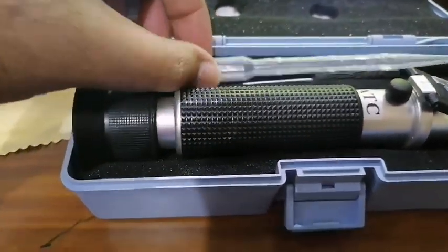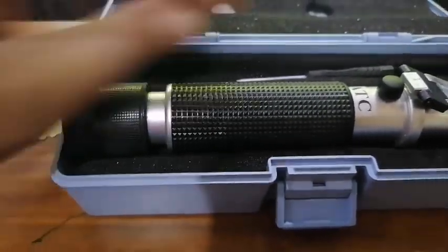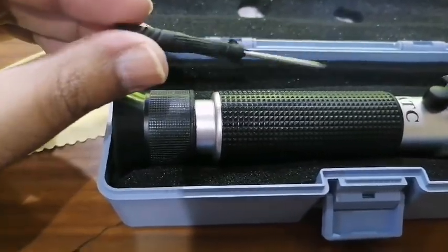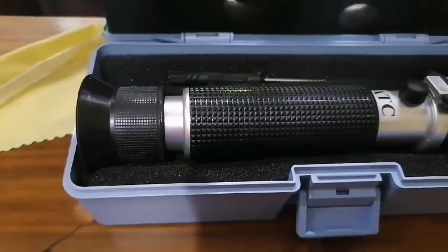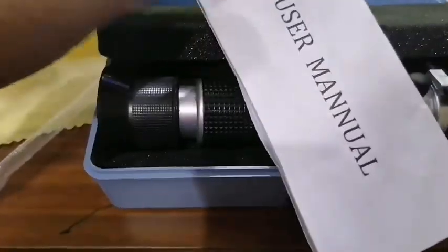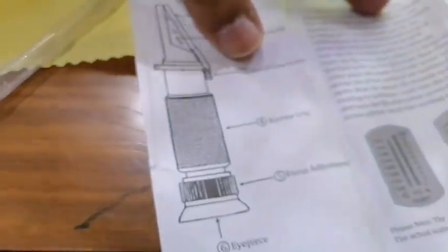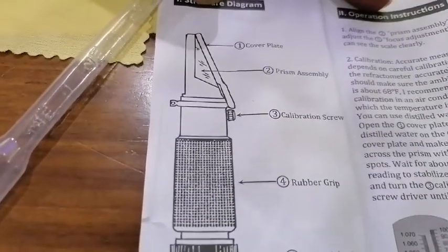Here is the refractometer, and this is the dropper for putting water drops on the prism. Here is the calibration screw and basically a calibration screwdriver. And what is this? This is a user manual. We can see what it says — here is the nomenclature of the refractometer.